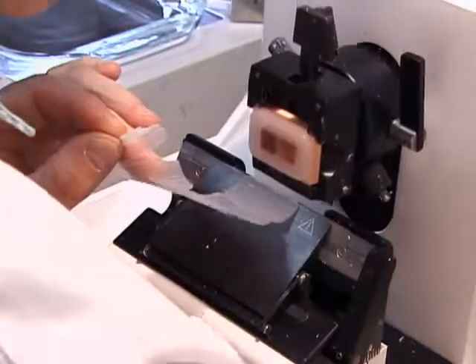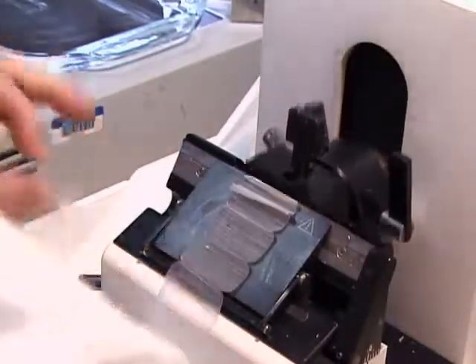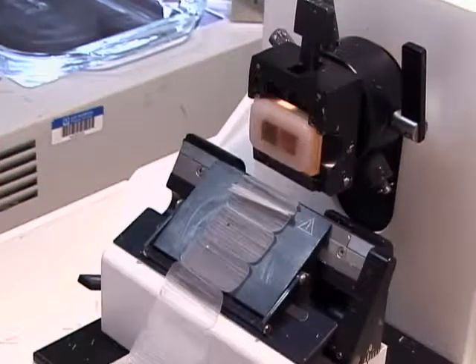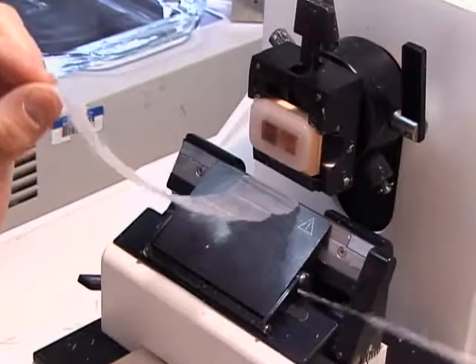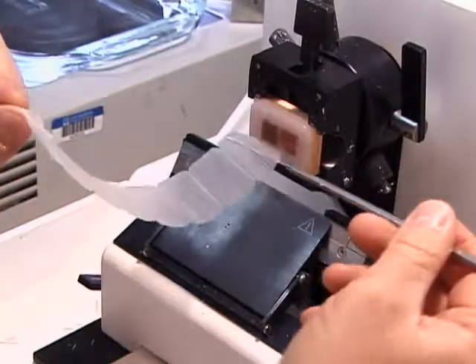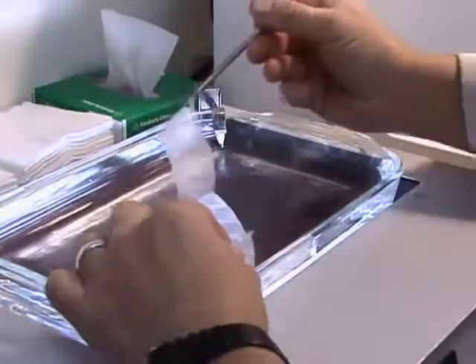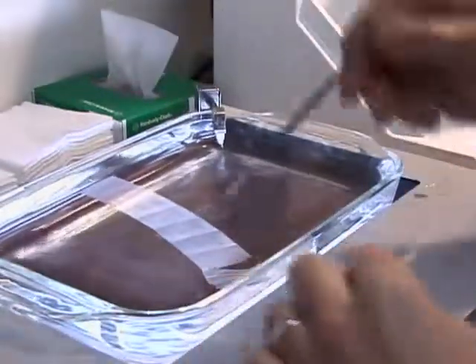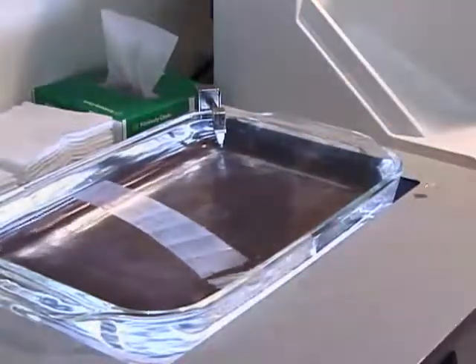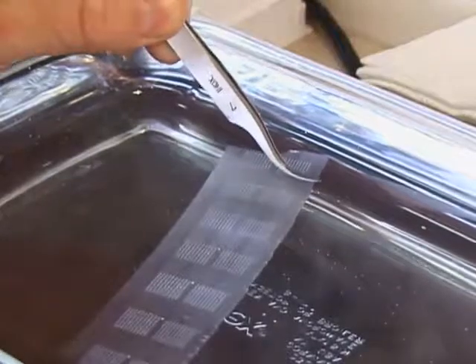Once I did an array that had 50 head and neck cancers, 50 prostate cancers, and 50 brain cancers. This unusual group of tissue demanded a different method of sectioning. I found that soaking the block on ice for a few minutes, then wiping a Kim wipe on the brain part of the array block, helped to produce nice sections. Of course, if all else fails, and not to deplete the array block, you can go back to the sectioning aid system.